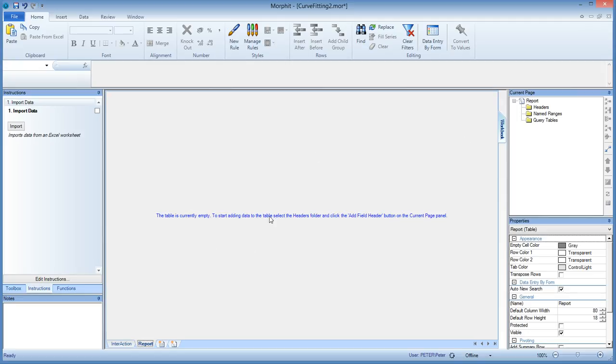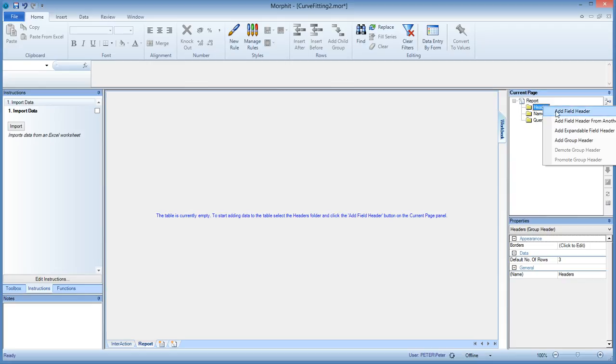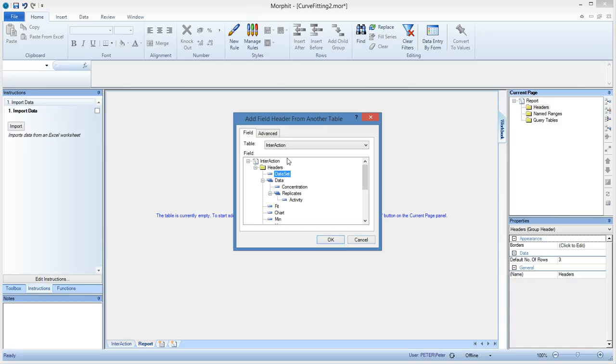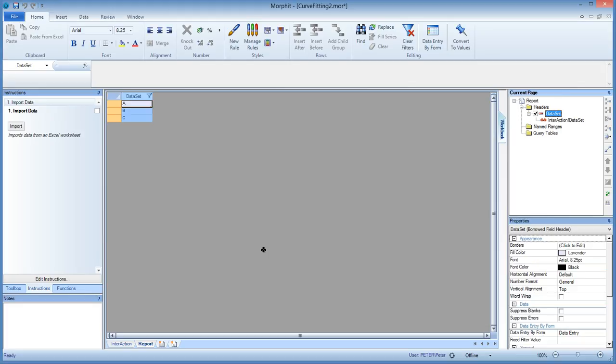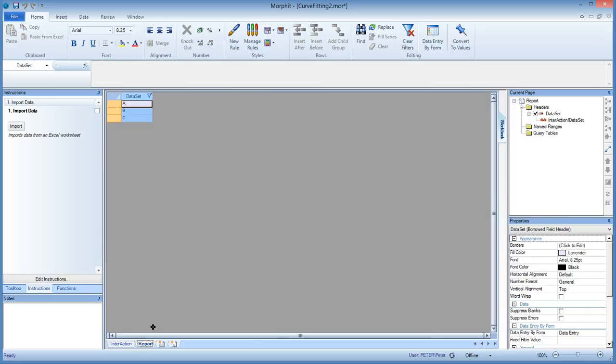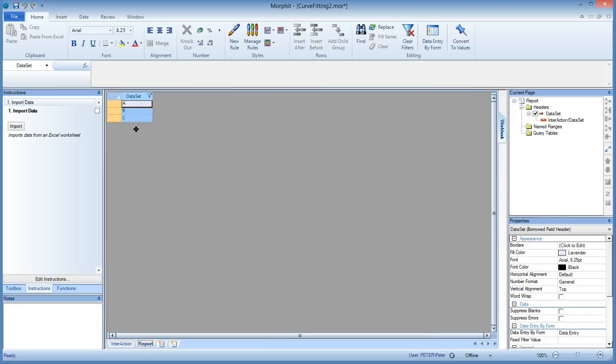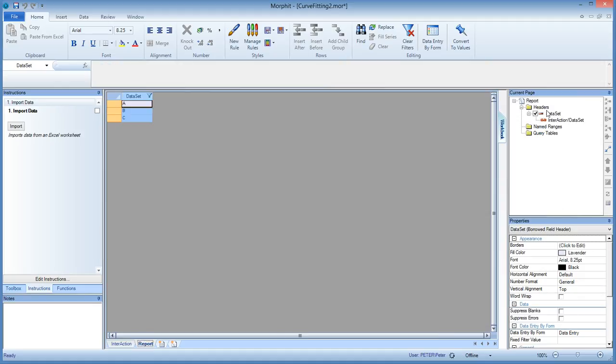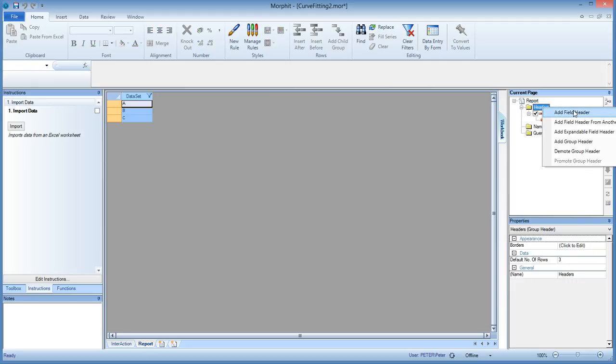So let's tell you now that we can add a field header from another table. So if we do that, we can bring in the data set from the interaction table. And this is the way how tables can be linked in Morfit. So in this case, we call this a borrow. So not only it imports the data set field from the interaction table, from here, but it's also bringing in the contents. So it sees that there is an A, B, and a C, and it imports those data in that linked field as well.